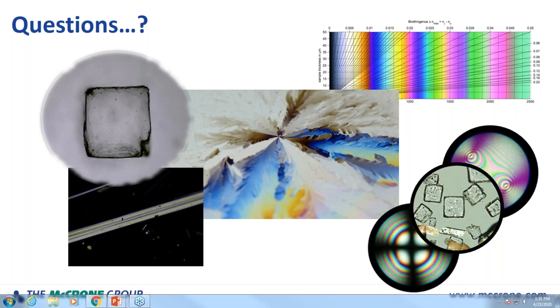That's pretty easy. Glass is amorphous. It doesn't have a crystalline structure. Quartz is hexagonal in nature. It has a crystalline structure. If you put both those particles on the same slide, get them focused, and then put your analyzer in, setting your scope up for cross-polarized microscopy, the quartz crystals would light up for you and be very colorful. The glass particles would disappear. They are isotropic. They would not be seen at all. They're infinitely extinct.